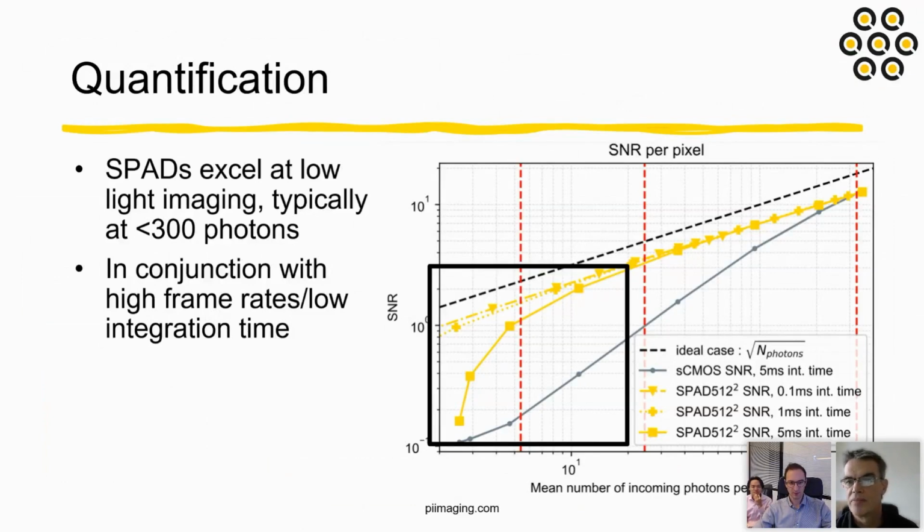Great, thank you. What is the size of individual SPAD when imaging in 512 by 512? So I believe the question is, what's the pixel size?